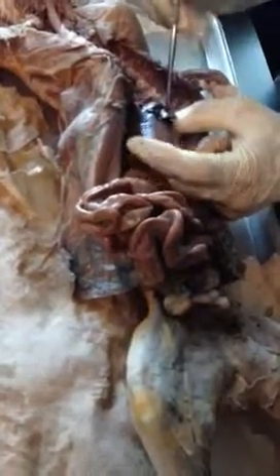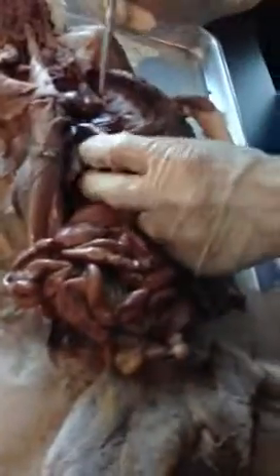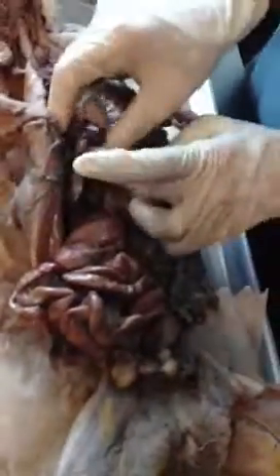It's held onto the diaphragm by the falciform ligament. This is the gallbladder. It's in the right medial lobe, so all of this is right medial lobe. This is right lateral lobe. This is left medial lobe. This is left lateral lobe.